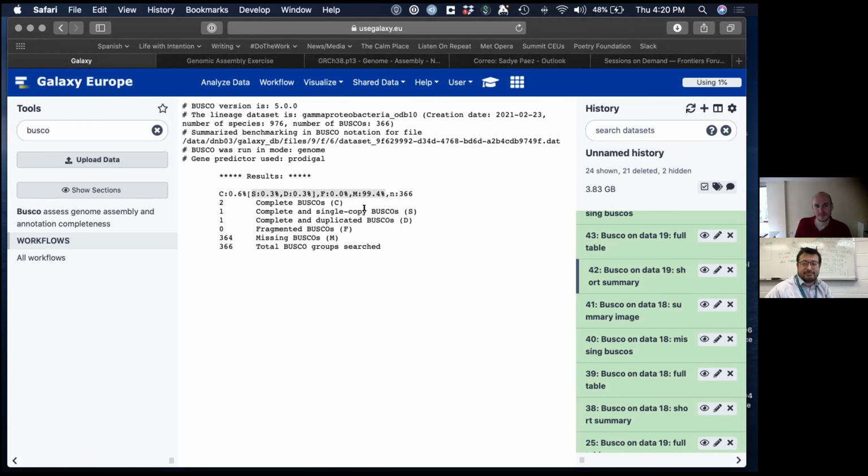So if this was our actual primary, this would be terrible. We recovered nothing. Actually, this shouldn't exist, but as I was saying before, it exists because the data is not perfect. So you will sometimes have something that looks like there might be an alternative allele, even if it's not possible.